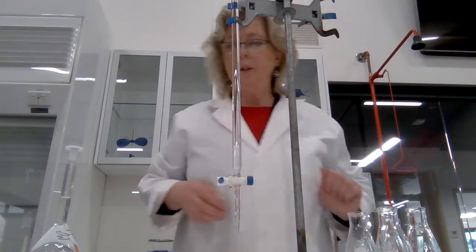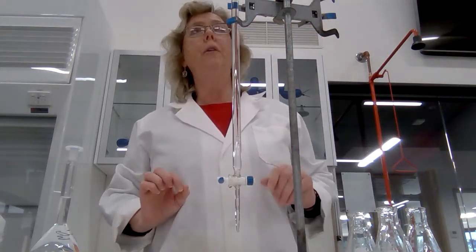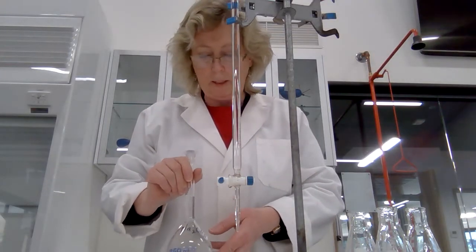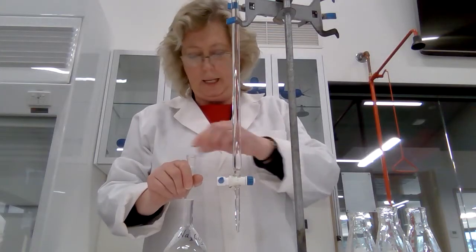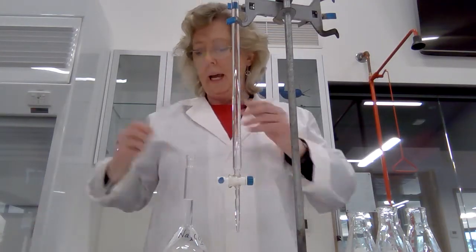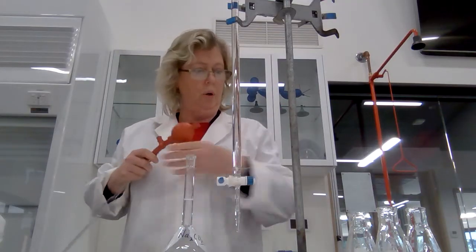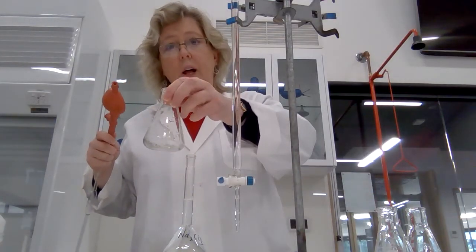We're going to do a titration of hydrochloric acid with our standard sodium carbonate solution. The sodium carbonate solution is going to be taken up using a pipette into our conical flask, which we'll then use for the titration.